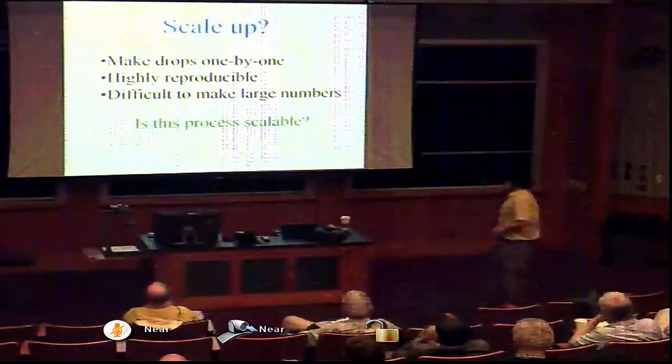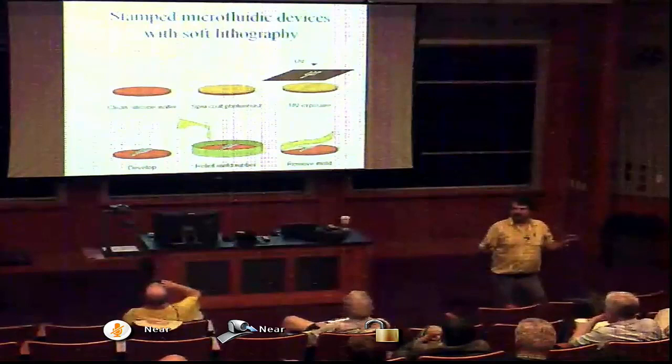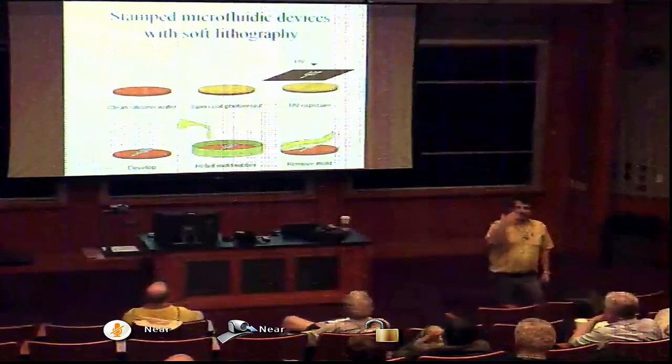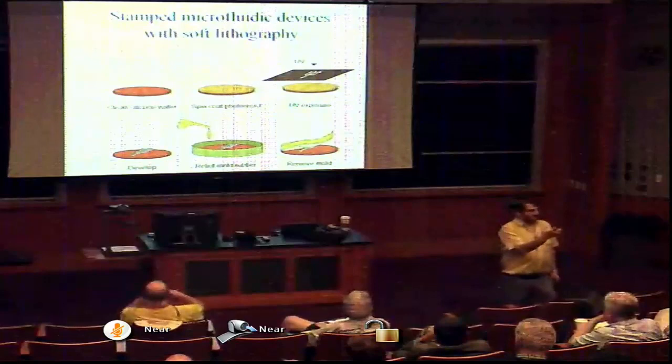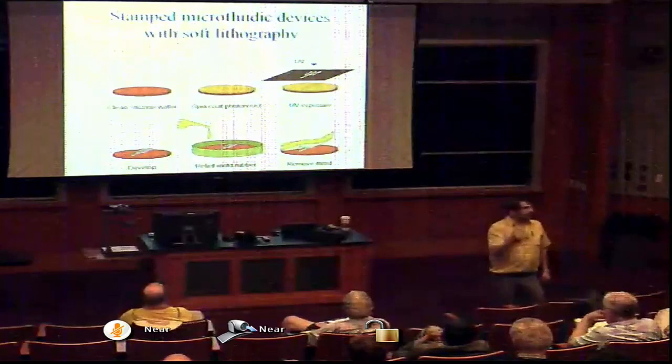Well, how do you do that? Remember I told you, Anderson, really a fabulous student, really a great student. He makes a device in half an hour. So I said, Anderson, we want to see, can we scale this up? Why don't you make two devices, and let's see if the emulsions that you make are the same. So we went away. An hour later, he came back, two devices, half hour each, and we looked, and we couldn't tell the difference between which device the drops came from.